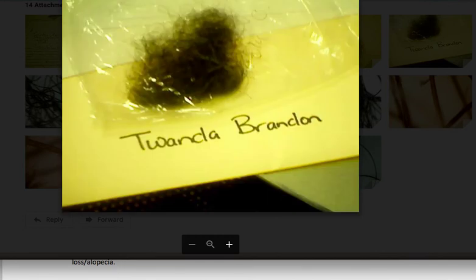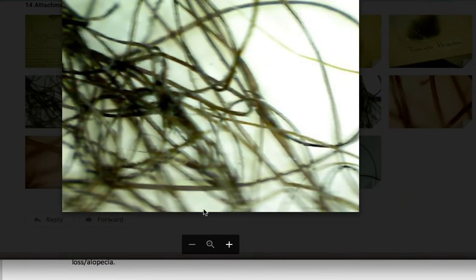So let's take a look, and this is the sample bag that you sent. So we're going to look under this lens, and let me try and blow this up a little bit. This is a 50X, and one of the things that we're seeing, let's bring that up a little bit and see if it'll stay for me. What you see here, and we're going to use a higher level of magnification, it's layers peeling.